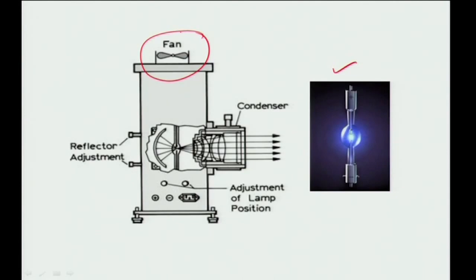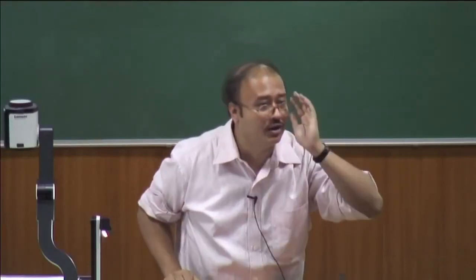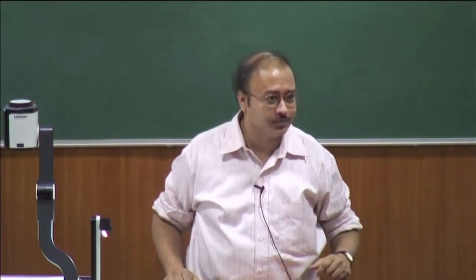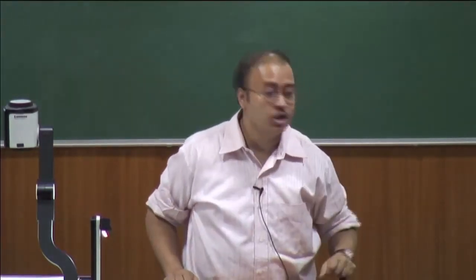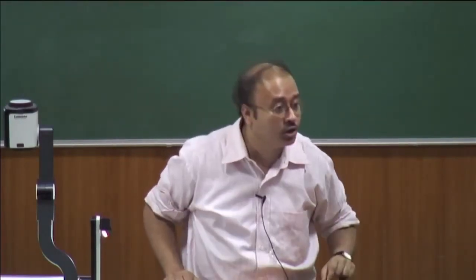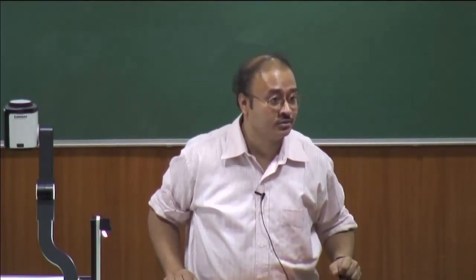Xenon lamp, because it is giving out so much light, that housing typically gets very warm. So if you ever look at the fluorometer at the place where you have the xenon lamp, you will see there is a fan running all the time. It cools it. Okay? If you see that the fan is not running, never put your instrument on, because it will damage your instrument. Okay.